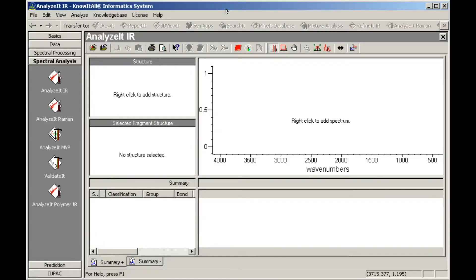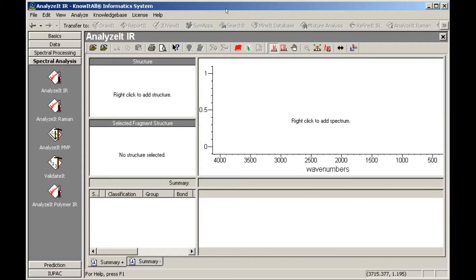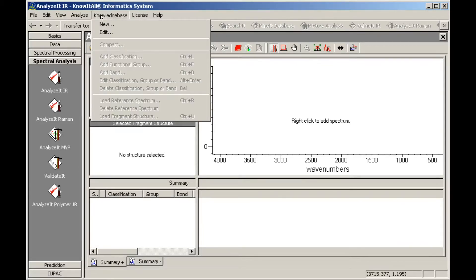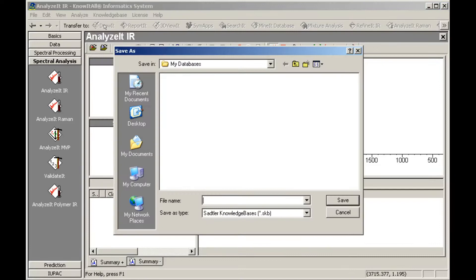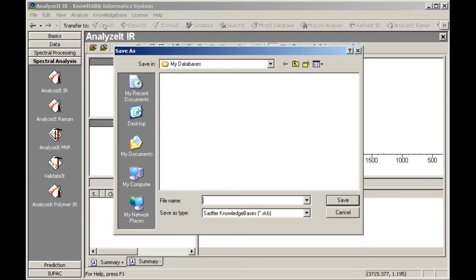We begin in the Analyze-It-IR application, found in the Spectral Analysis Toolbox. Open the Knowledge Base menu and choose New. Use the Save As dialog box to specify the location and name for your user knowledge base. The file type, Sattler Knowledge Base, cannot be changed.